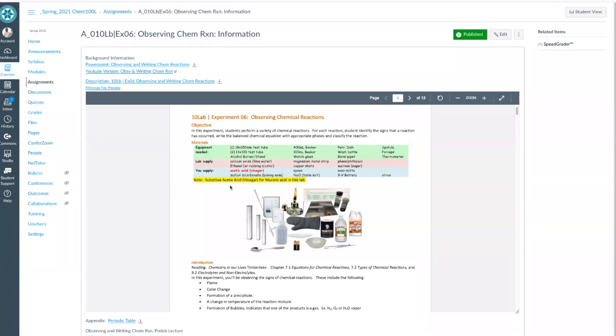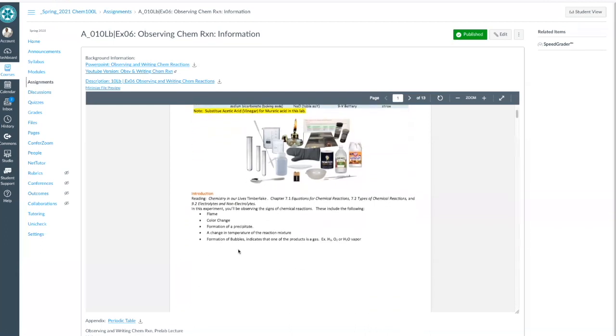It'll do the job. So this is what you guys will need. You need your alcohol burner. What I have, actually, I will be able to do this experiment with just a little candle. That'll work too. So these are the materials, and what I would like to discuss is how to fill out the data sheet.